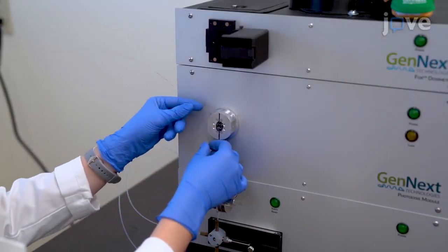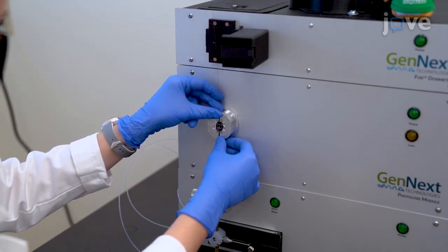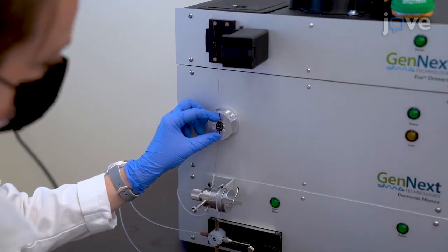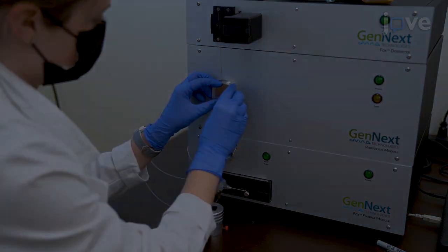Then place the capillary into the grooved channel at the base of the photolysis cell, and center the capillary window with the photolysis cell window. Hold the capillary in position and add the magnetic mask.